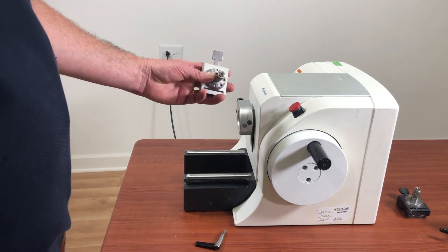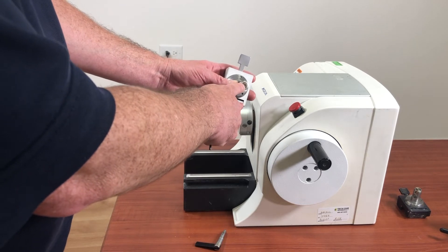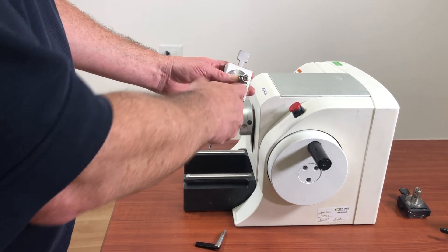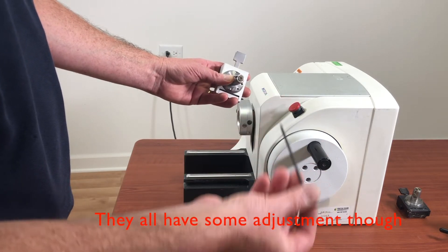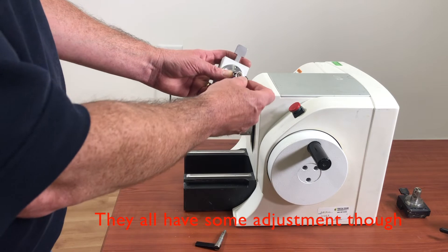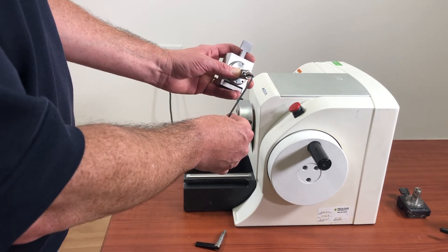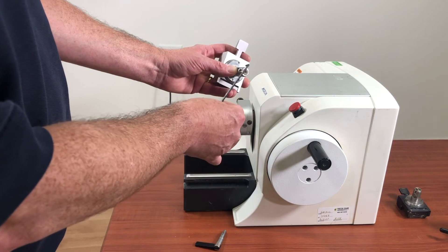Now take a look at the back of your cassette clamp, and you'll see a little Allen screw right there. That little Allen screw is what we're going to be using to adjust it. We'll need — and this is not true for all microtomes, but for this one — a 3mm Allen wrench. We'll insert it into the screw and turn it just a very little bit, and a little bit goes a long way on these things.